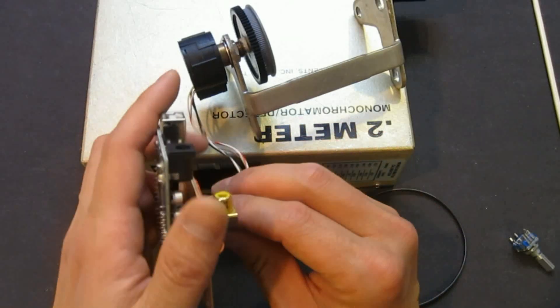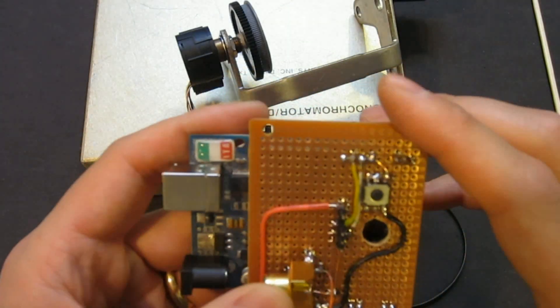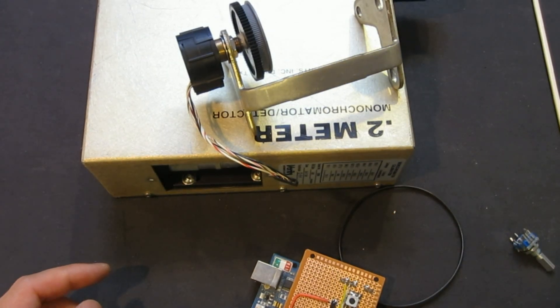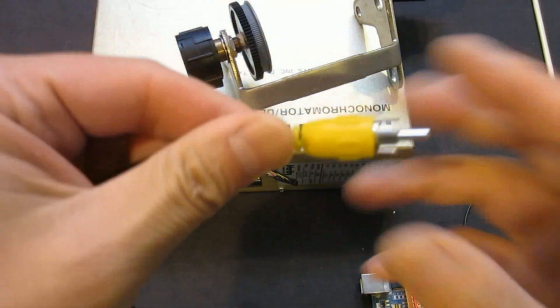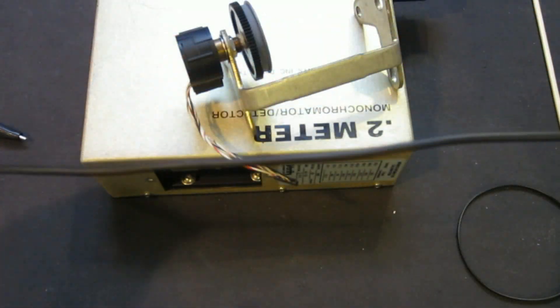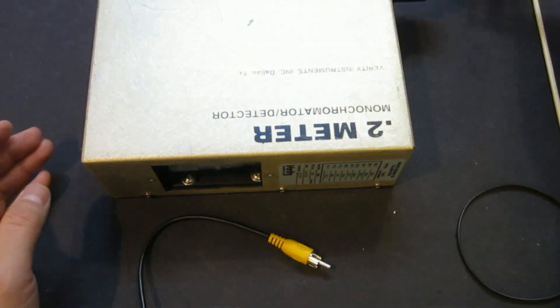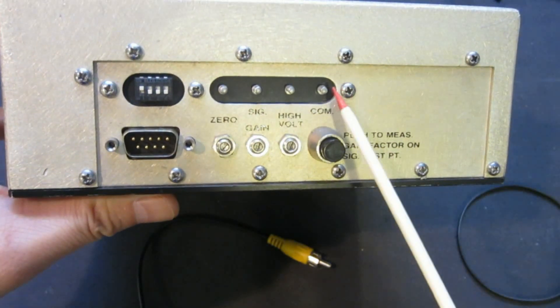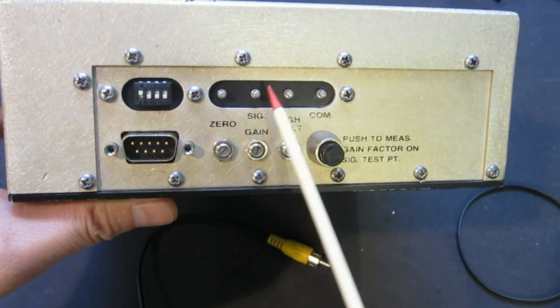I also have a lot of cables here. This is a simple RCA cable which I use for connecting to the outputs of this monochromator. The output would go to an RCA cable, which provides a very nice connection, and it's reasonably shielded so hopefully it will reduce the noise as well. On the other end, all we need is to connect that cable to the two terminals here — one is common, which is the ground with respect to this signal output.